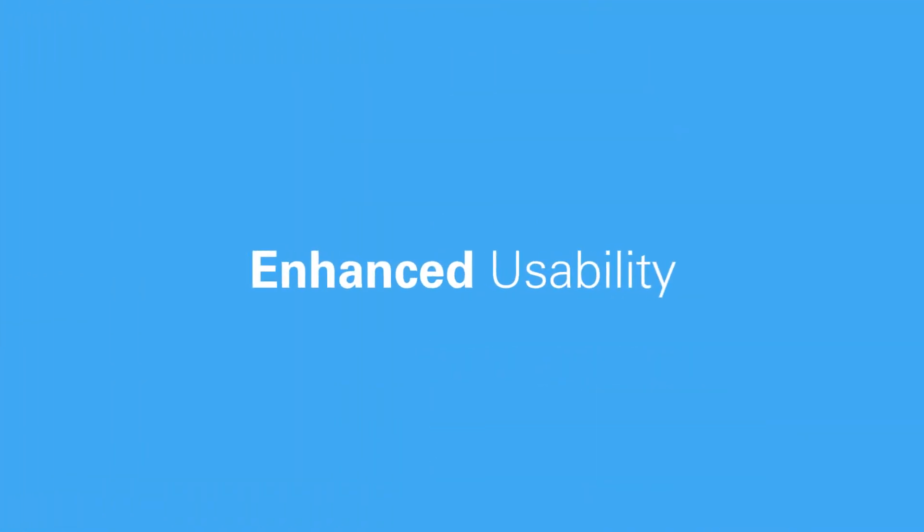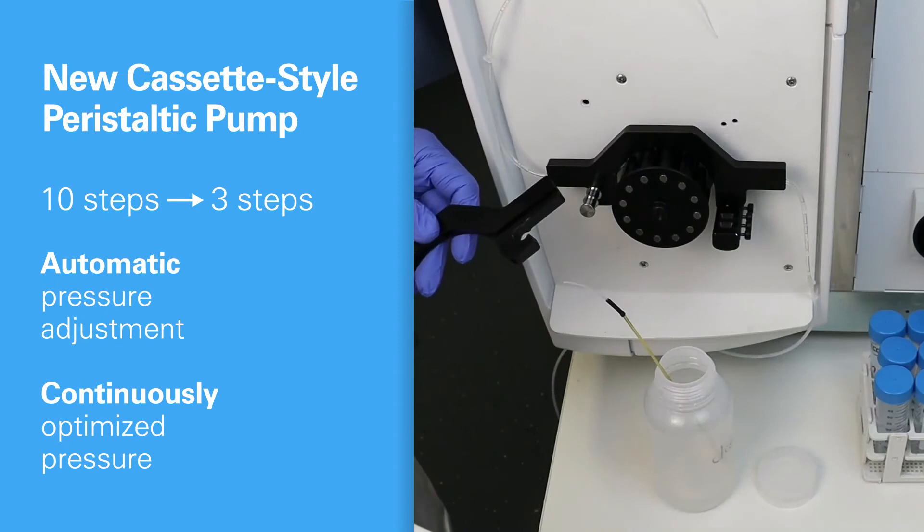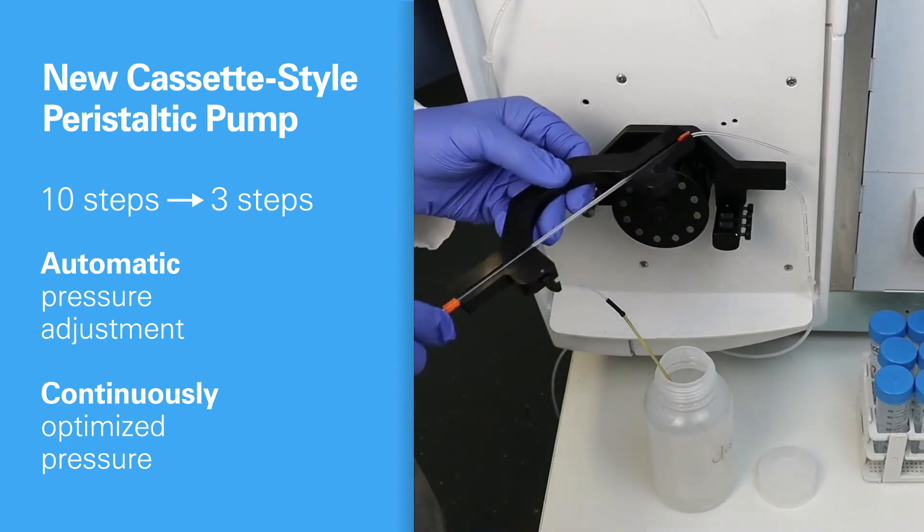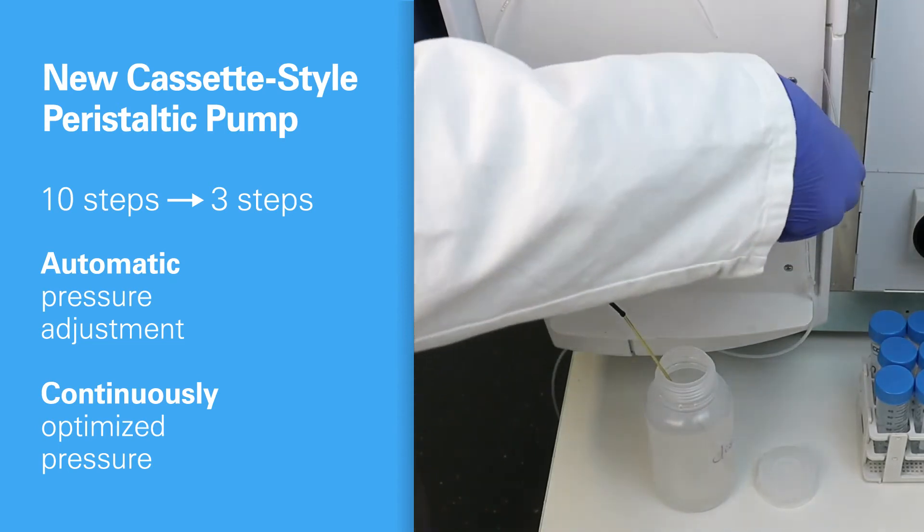Also, the latest SpectroArcos adds improvements to increase your ease of use. Instead of taking 10 steps to adjust sample introduction tubing and pressure, just click in the new cassette-style peristaltic pump in only 3 easy steps.